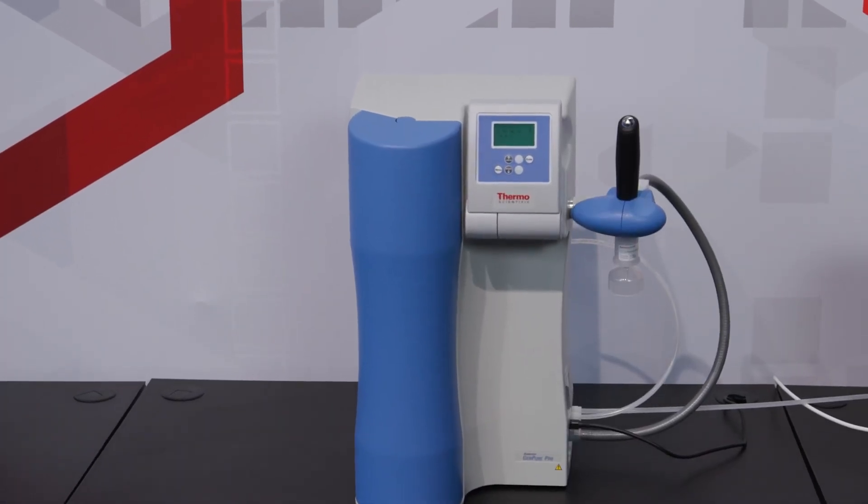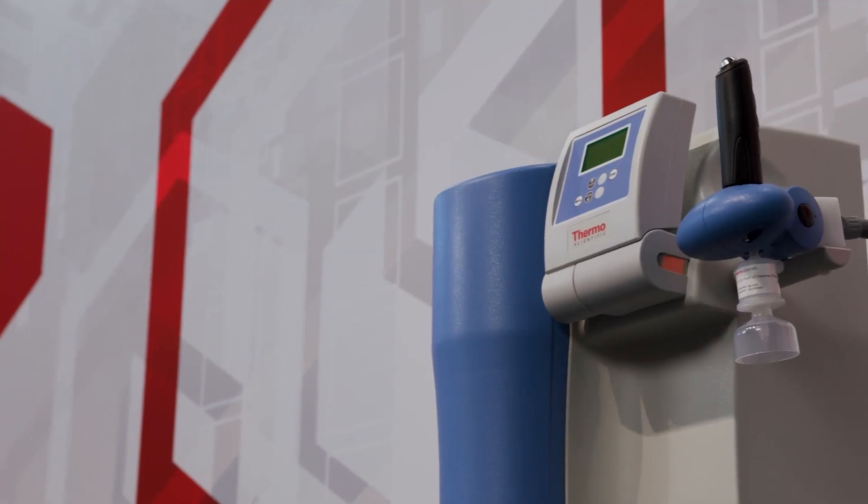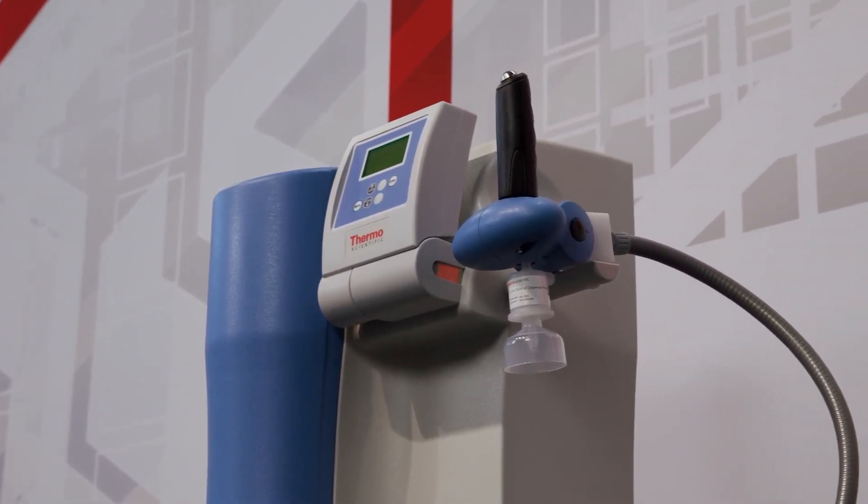Welcome. In this video, you'll learn how to disinfect the Thermo Scientific Barnstead GenPure Pro water purification system and replace the UltraPure cartridge.